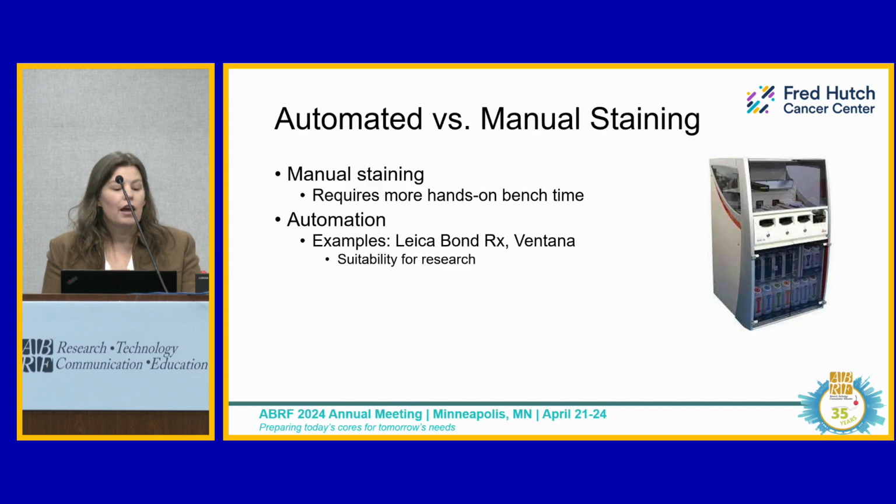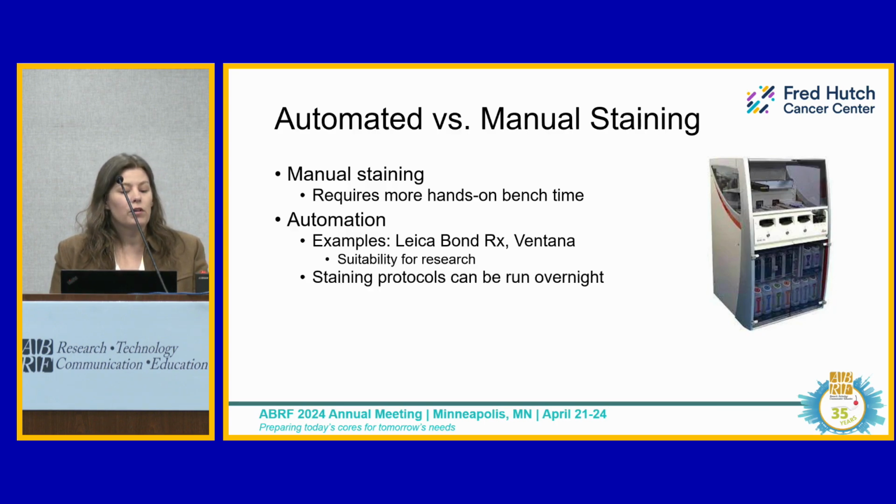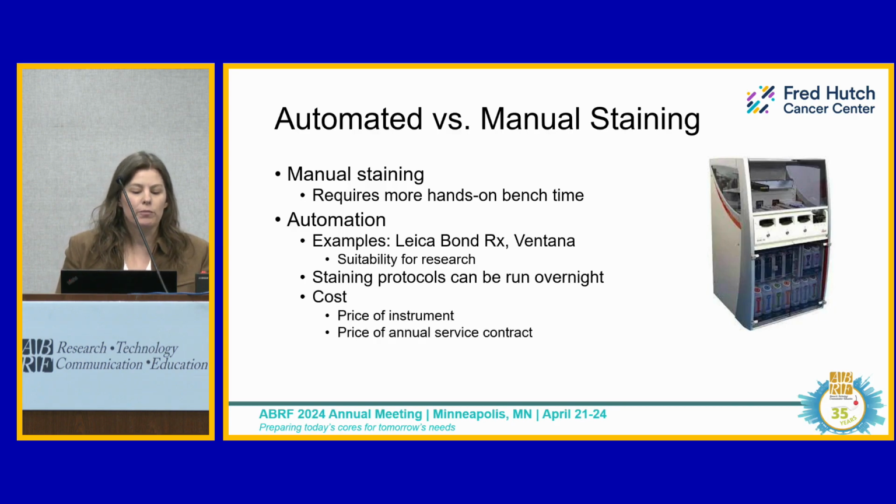If you're looking at purchasing a stainer, I would look at the suitability for work in research. Many of these are going to be built mostly focused on the clinical setting, which is fantastic, but in the research setting, sometimes we like the ability to unlock the software where we have a lot more flexibility in terms of putting our protocols together. Staining protocols can be run overnight if you're using an automated stainer, which is also another benefit. So you can set up the study at the end of the day, run it overnight. The next morning, the technician comes in and can begin imaging.